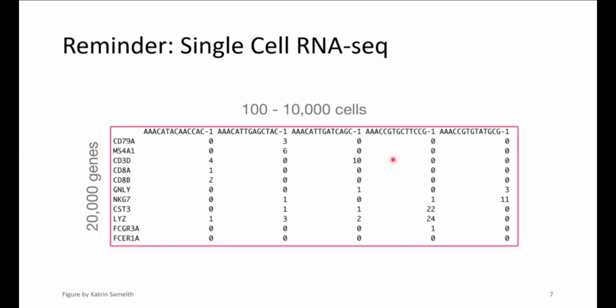Maybe to remind ourselves, and here I take a figure created by Katrin, how does single cell RNA sequencing data look like? I think that's basically a big table where you have cells denoted by barcodes, you have genes, and you note down their expression, right? And that gives you a high-dimensional state space, and you can analyze this, and Katrin introduced you to that yesterday.